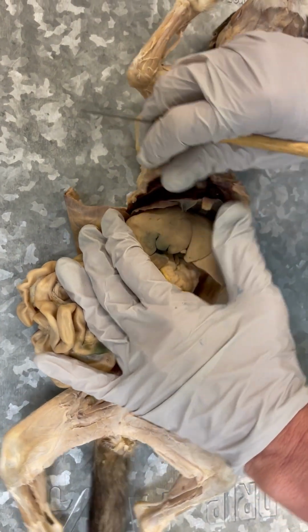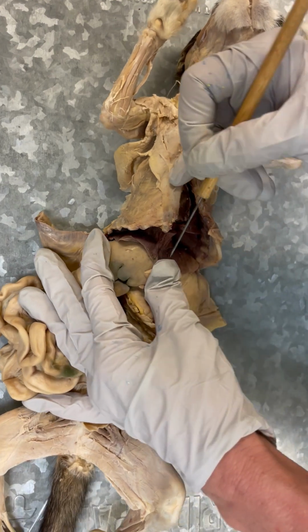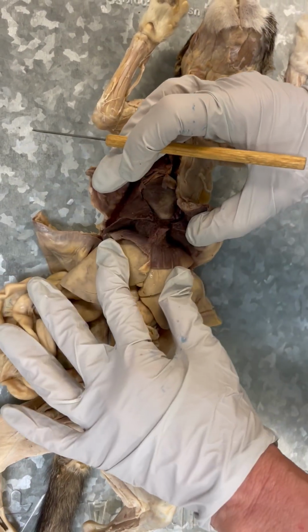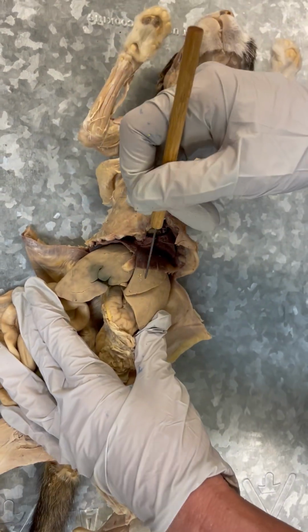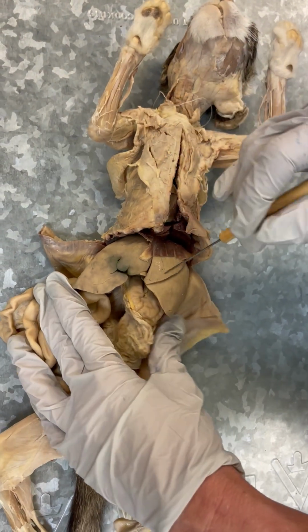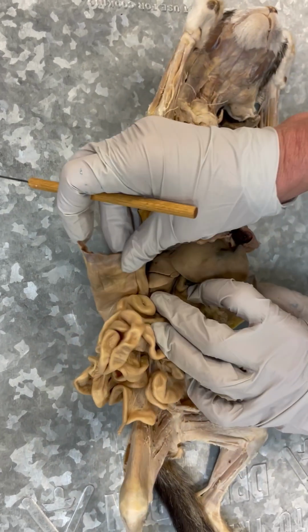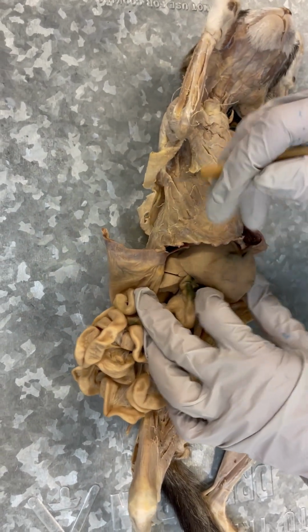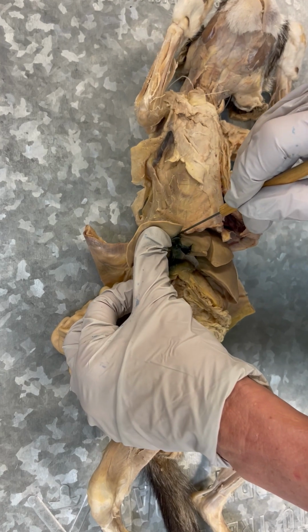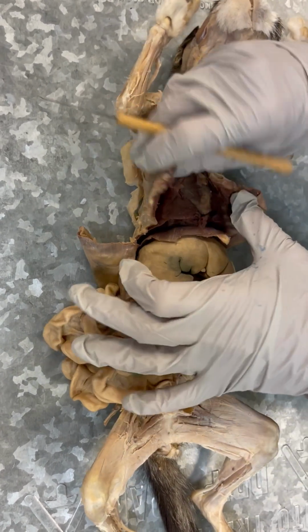When we look at the liver, on top of the liver, we see the diaphragm. The diaphragm looks a little bit like a red onion. And you see the left anterior lobe, the left medial lobe, the left lateral lobe, the right medial lobe, but the right lateral lobe is way back here. And again, that gallbladder is inside the right medial lobe.